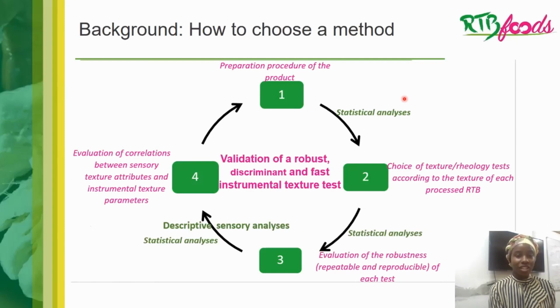To begin, I take you back to 2019 when we were still able to meet in person, and Layal presented these to show the steps you need to follow when developing an optimized method for instrumented texture. We have made a few modifications because we believe that statistical analysis is a relevant component, a guiding factor when making the choice at every stage.